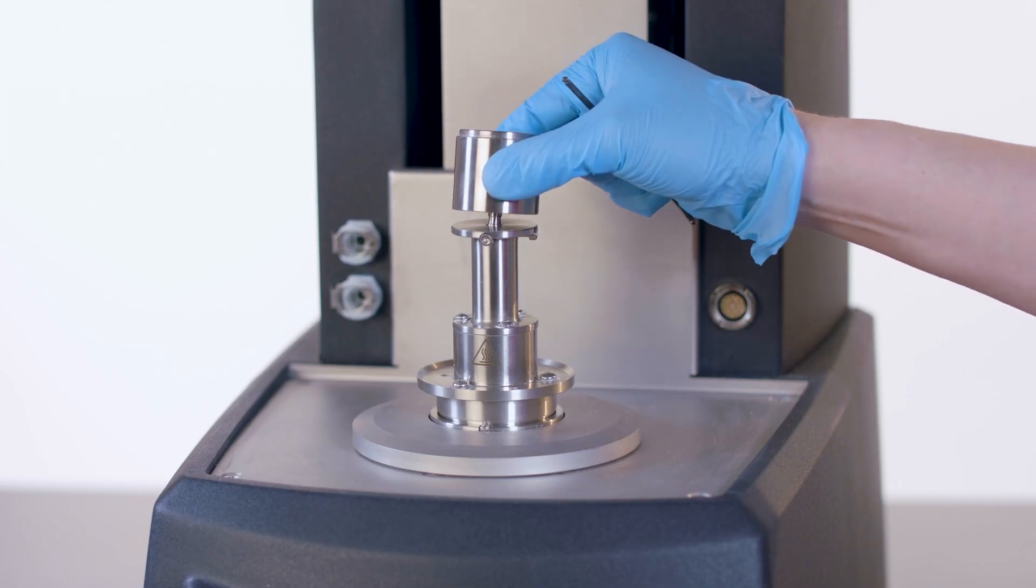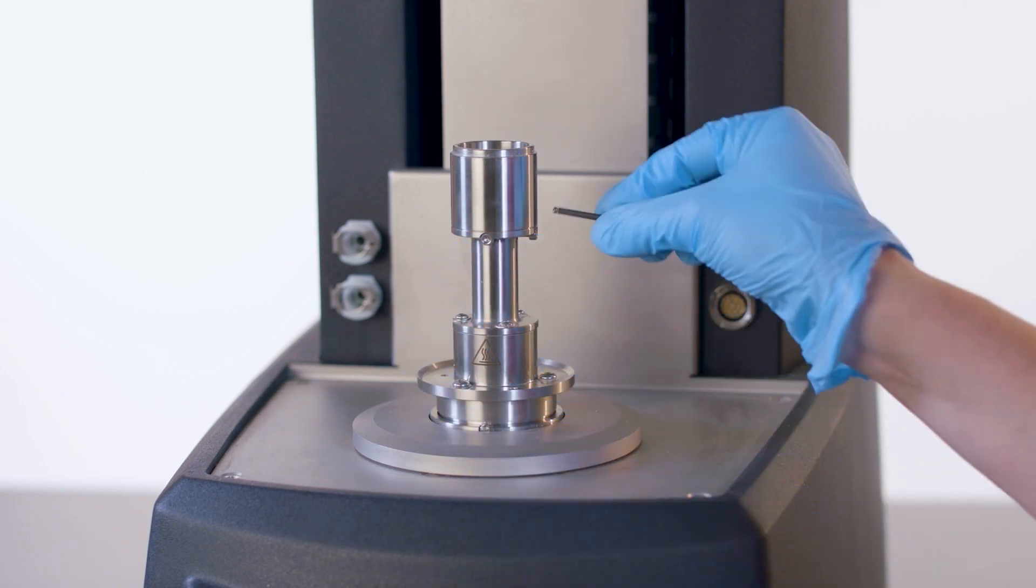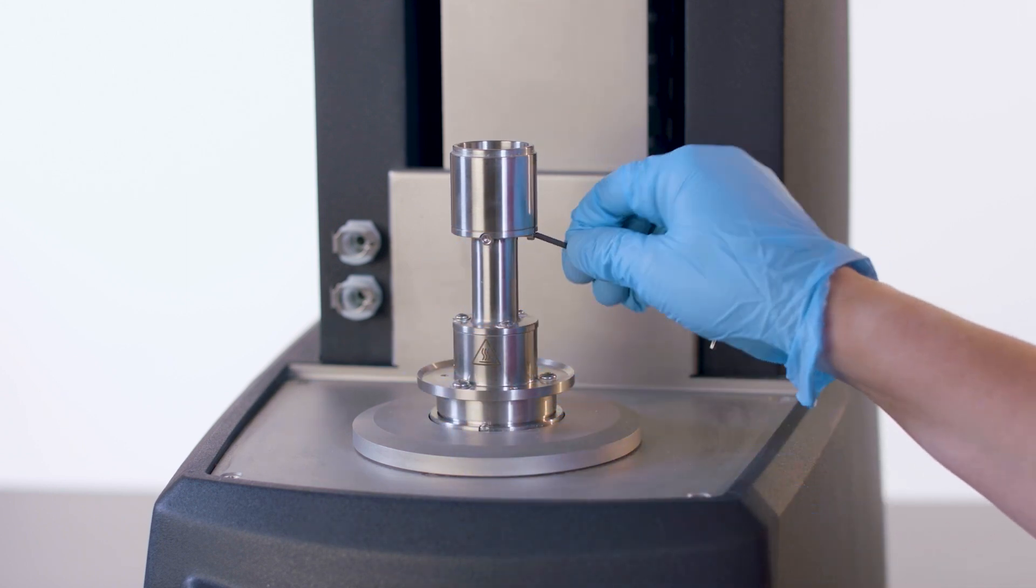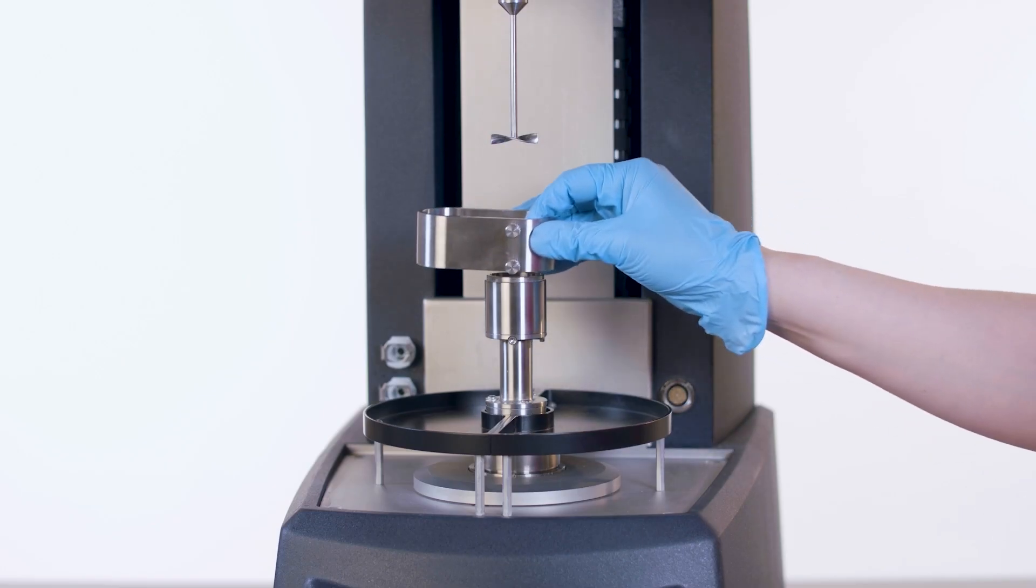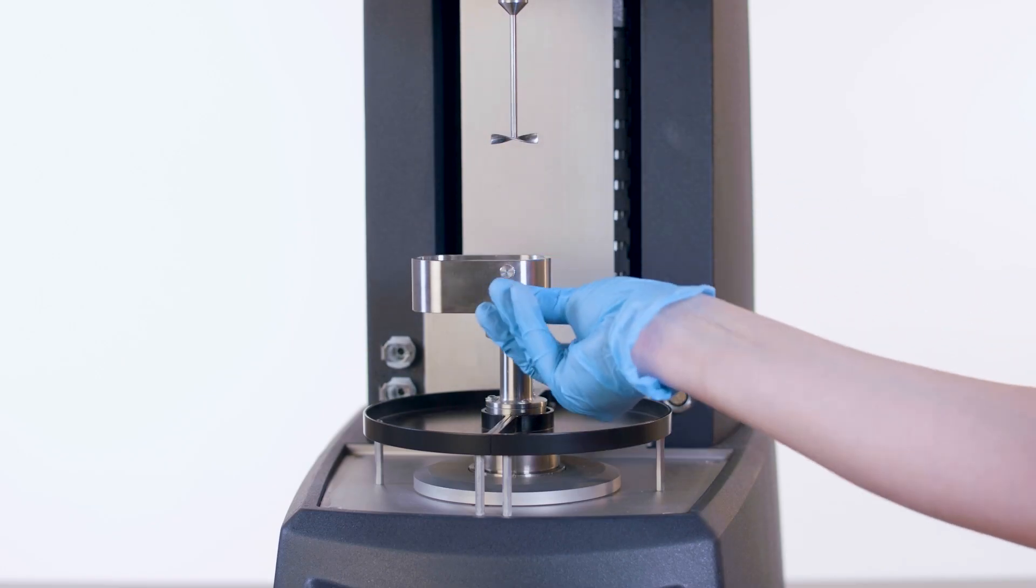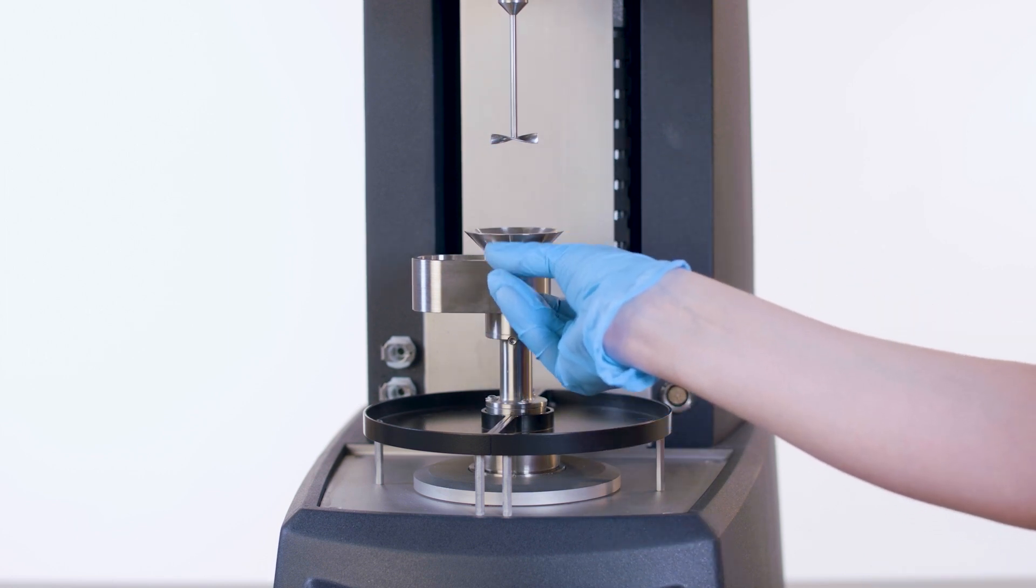The flow cell cup is secured to the pedestal with two set screws. The trim slide is placed over the cup and tightened with the bottom thumb screw. The trim funnel is then placed flush with the trim slide and secured with the top thumb screw.